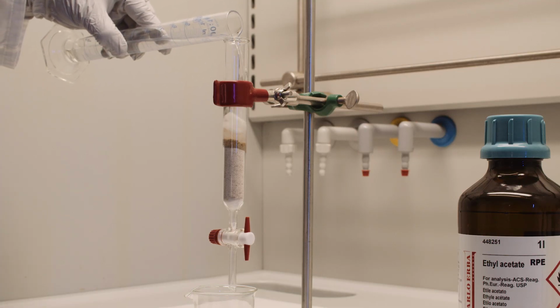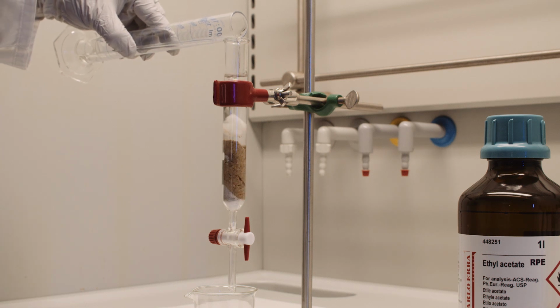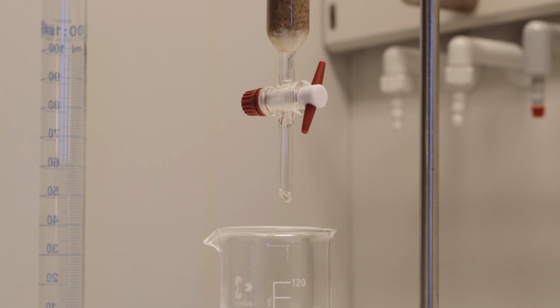Here it is important that the valve of the column is fully open and allows air to escape. When the mobile phase begins to drip out of the column, close the valve, if necessary, to achieve a flow rate of about 1 drop per second.